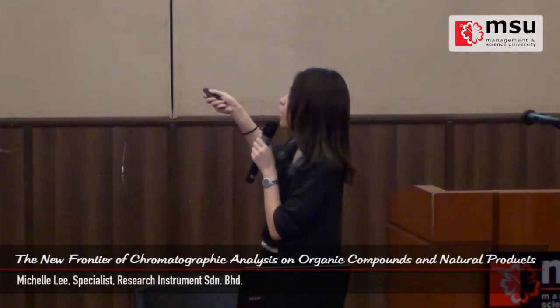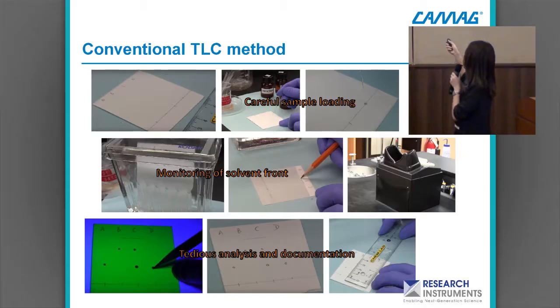And then after you draw it, you use a capillary glass to apply your samples, like you apply over here. You need to be really careful because if you don't control it, you will end up with a really large spot.